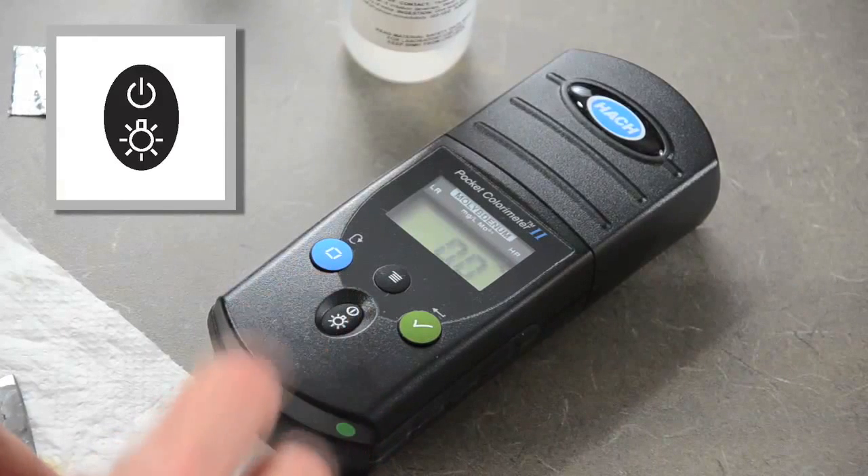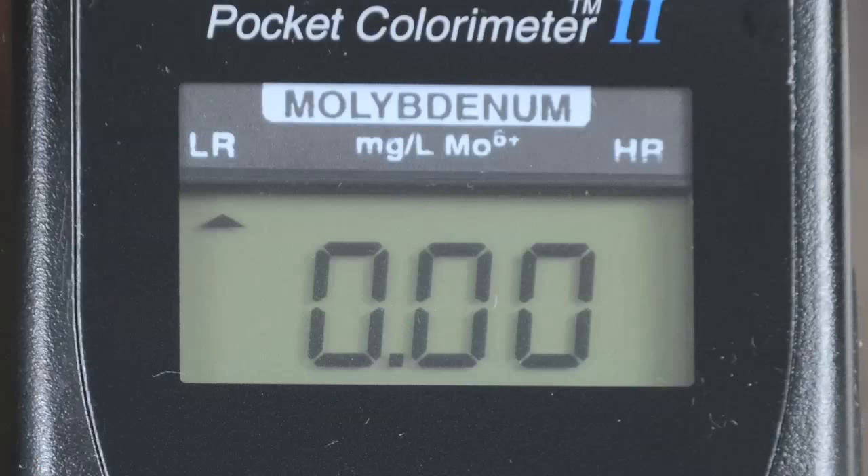Begin the low range test by turning the unit on. The arrow should indicate the low range channel.